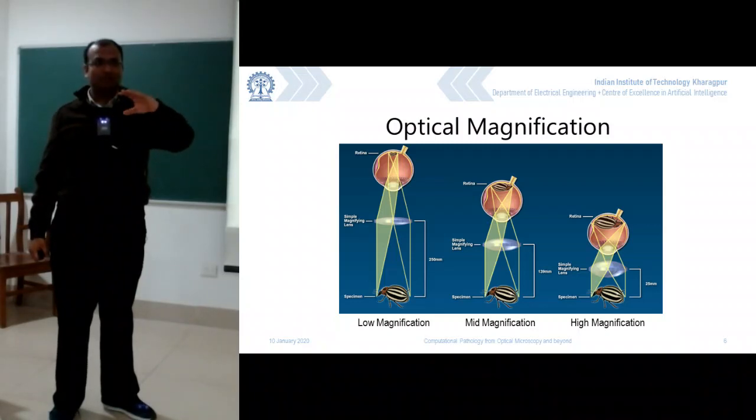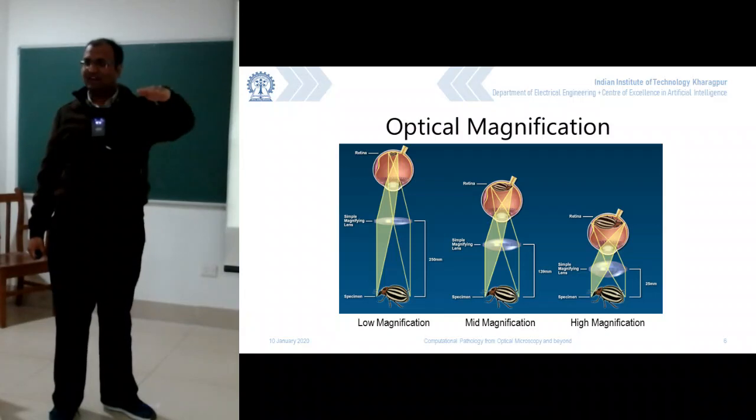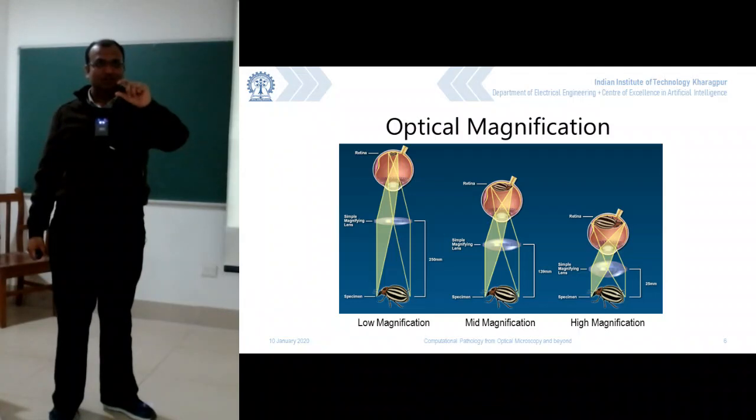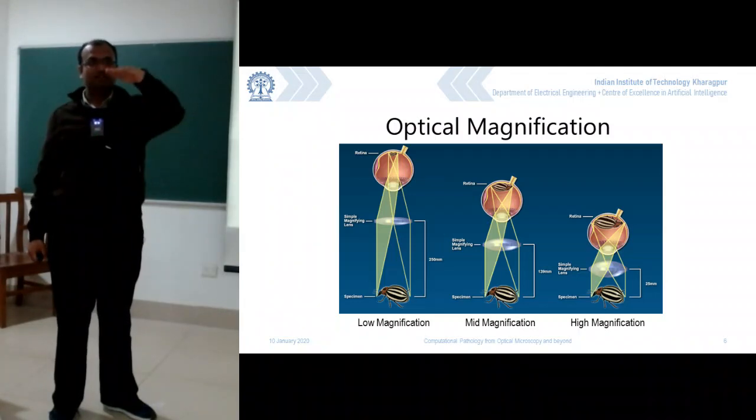Now look at this thing. For all our practical purposes, we were assuming a lens to be a flat plane. But a physical lens is not a flat plane. It has a bulge in the middle and it tapers at the sides. So obviously there is a limit to which you can push your object closer to the lens, and the closest you can put an object to the lens is that bulging part. Anywhere closer than that you will not be able to go.